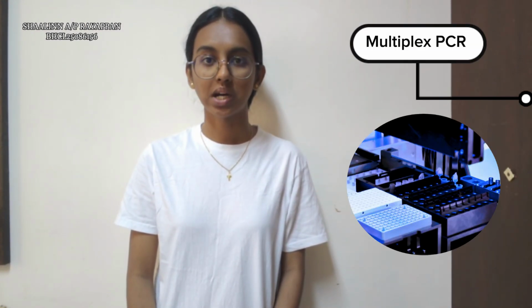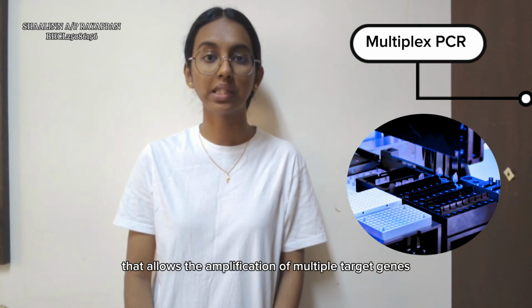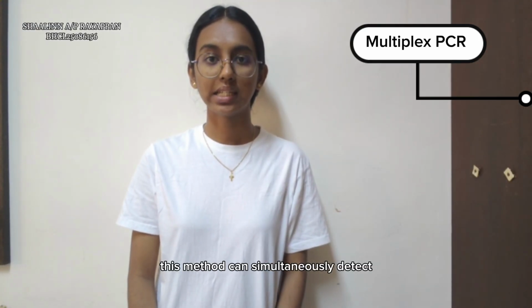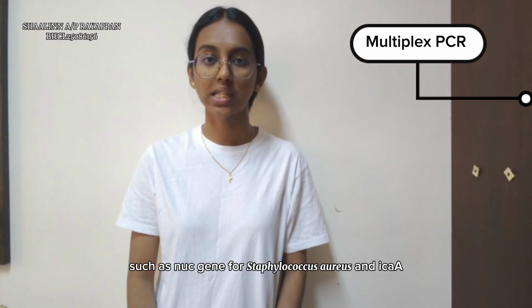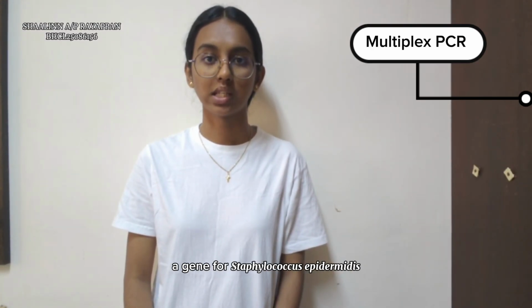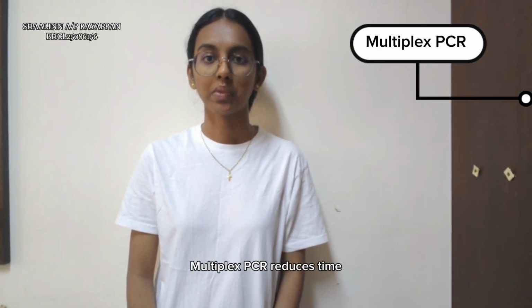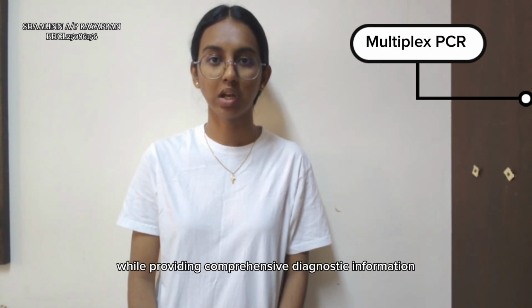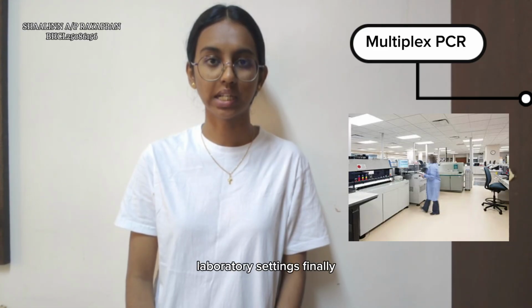Secondly, multiplex PCR is an advanced form of PCR that allows the amplification of multiple target genes in a single reaction. This method can simultaneously detect species-specific genes such as the nuc gene for Staphylococcus aureus and the ica gene for Staphylococcus epidermidis. By combining several targets in one test, multiplex PCR reduces time, cost, and sample volume while providing comprehensive diagnostic information, making it especially useful in clinical and hospital laboratory settings.